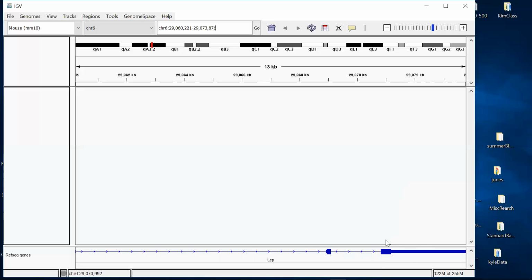Okay, something that's annoying me: you can see how every time I try to point at something, it opens a window.